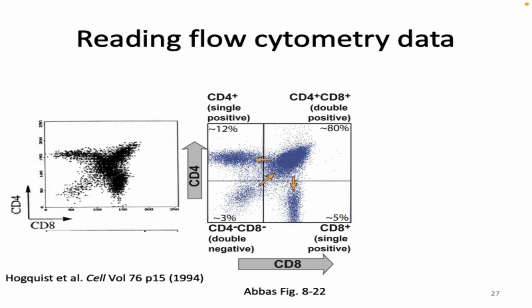I also want to show you a couple things that you can see here. Oftentimes when we look at plots like this, though it doesn't have to be, we tend to draw our gates like this, where we make quadrants. So we often will do it like this, though it doesn't actually have to be. We can see, we get percentages of how many cells are in each quadrant.